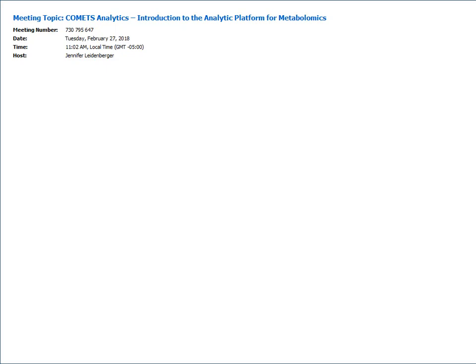On the COMETS Analytics page, right underneath the button for download sample input, there's another button that says download master metabolite list. So it's public right now. Anybody can just go on and grab it. That's our current version, by which I mean the version in production. We have another one that we're about to include in the new production, probably in about a week and a half to 2 weeks. It's going to be a work in progress, and we're going to be continually updating it. But yes, we do keep it public, and we welcome any comments.